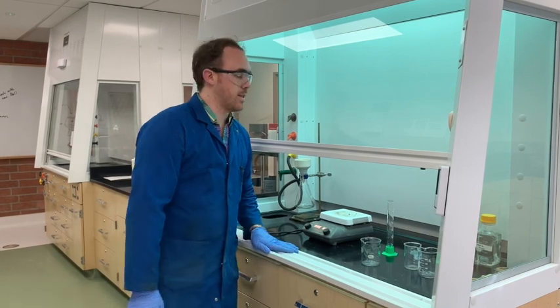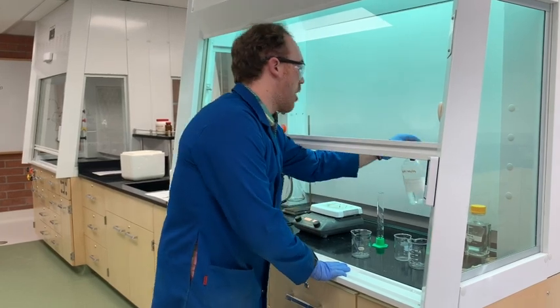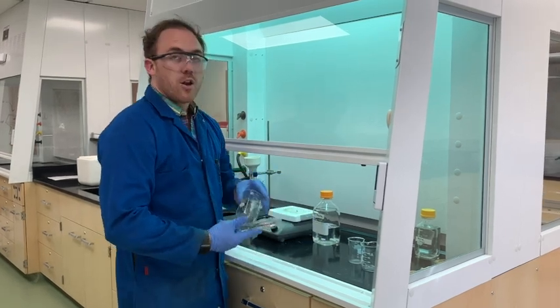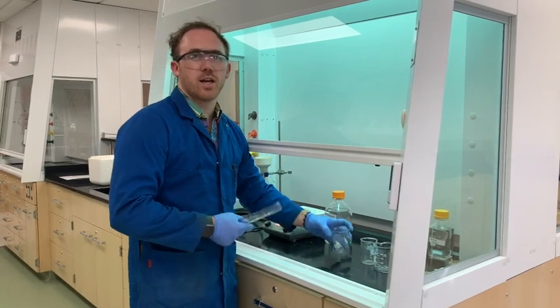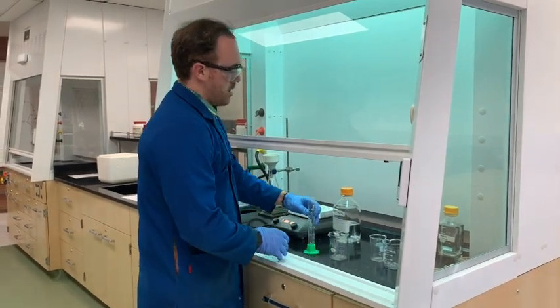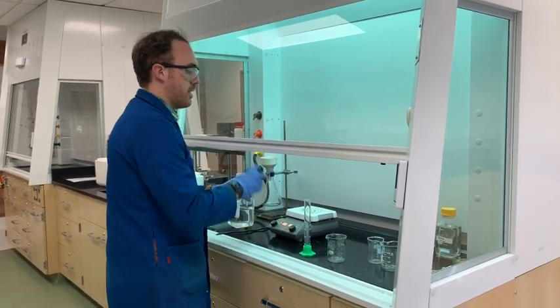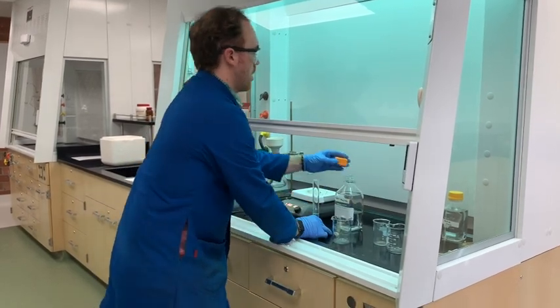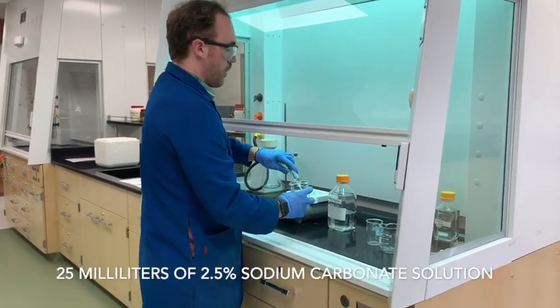So what we're going to start with is 25 milliliters of sodium carbonate. We're going to just take 25 milliliters of that and put it into this beaker. Normally the procedure calls for an Erlenmeyer flask, but we didn't have any lying around that looked clean enough, so this will work perfectly well. Just something that you can heat in is all you need. So 25 milliliters is about half of this. Awesome. And I'm just going to place this in the beaker.